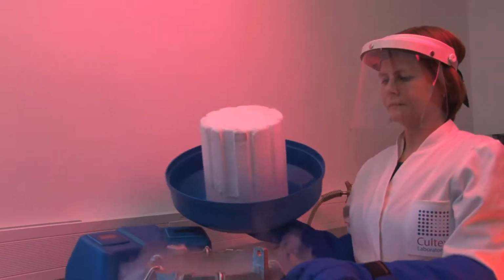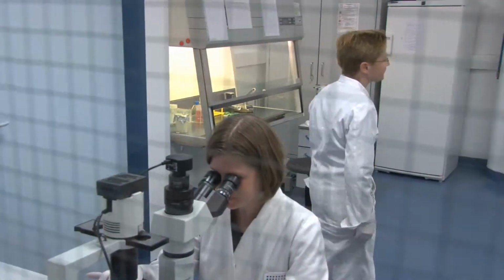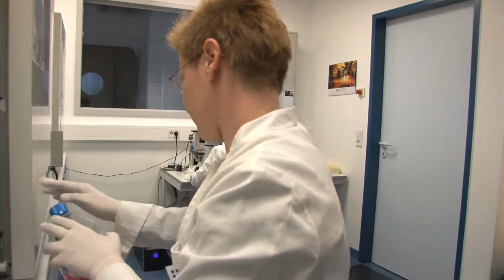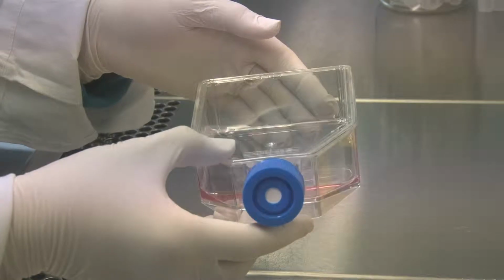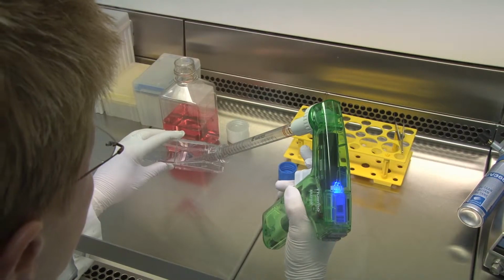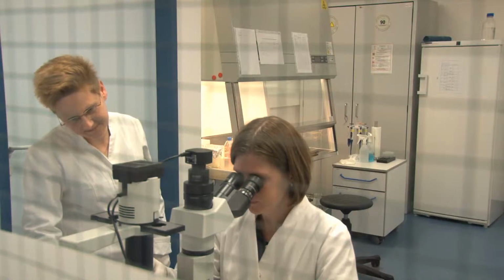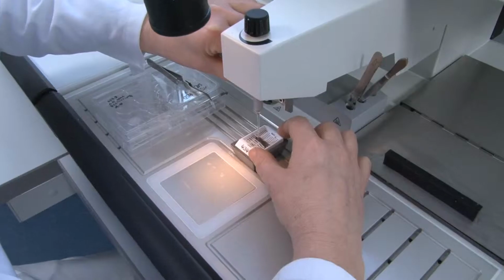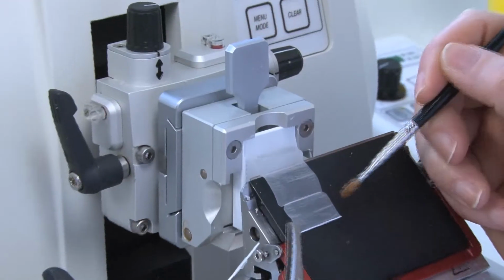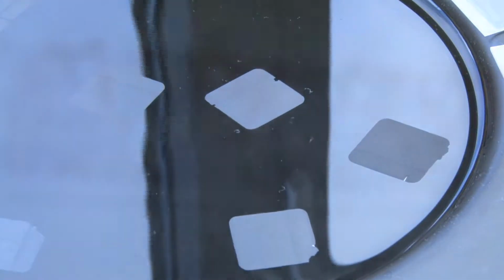Draw on the experience and expertise of our team to plan and implement your in vitro research. Benefit from our knowledge regarding appropriate cultures and optimal culturing methods for cells and bacteria in preparation for exposure. Special test procedures ensure the relevant culture exposure. In this way, the ideal starting situation for the tests is guaranteed. We are always expanding the range of testable substances, as well as realizing the optimum experimental setups for different applications. You can benefit from it immediately.